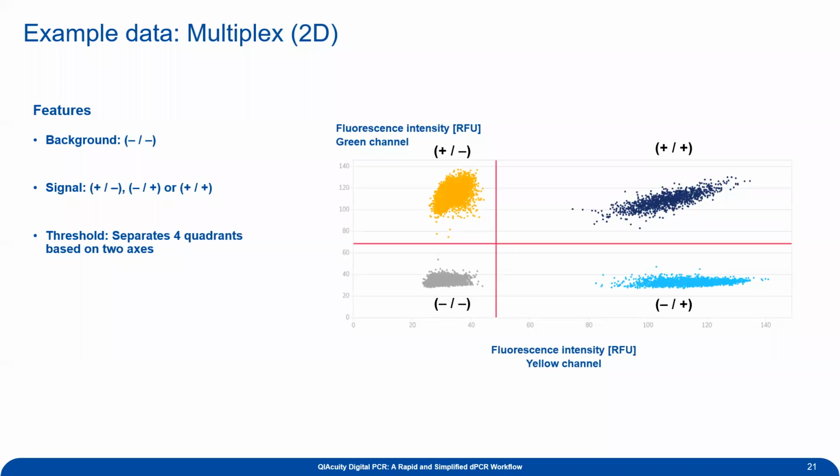If you look down below here and hold it up to the light, you can see the little squares correspond to the per well partitions. For 5-color, I don't have one here today, but I can pull it up at the end to show everyone. For 5-color analysis, we don't have any 5D plots yet just because our brains tend not to work well in 5 dimensions. But you just iteratively choose what you want to see on your Y and X axes to do that in 2 dimensions.